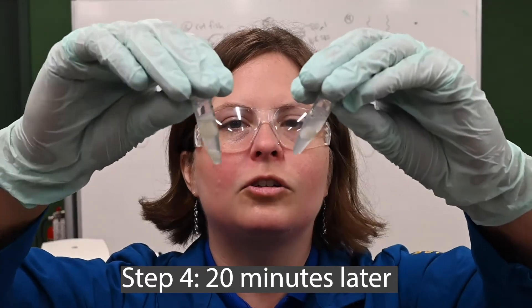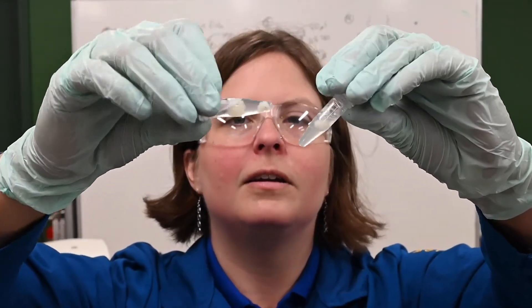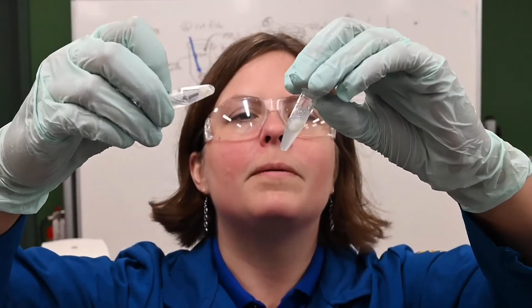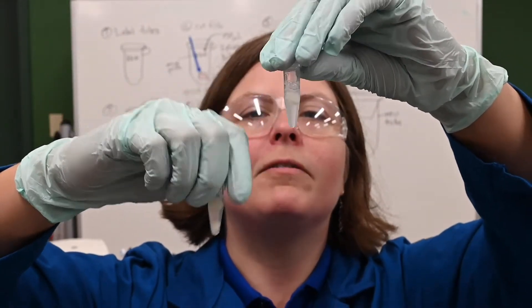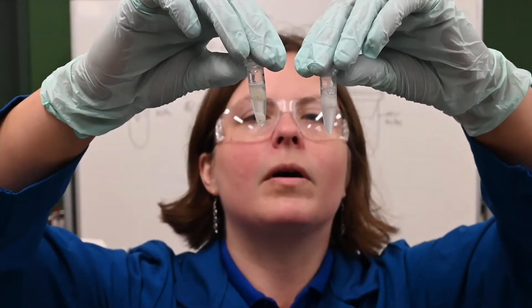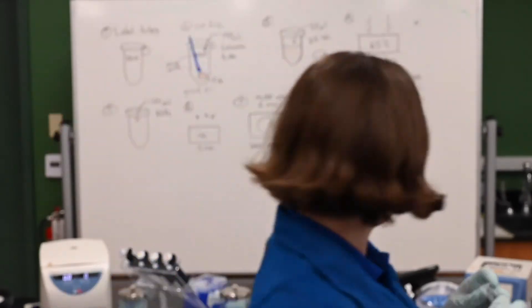There's definitely chunks. So that is fish cells, fish lipids, fish proteins, and this liquidy part, that's going to have the DNA. That's what we want. So let's keep going.